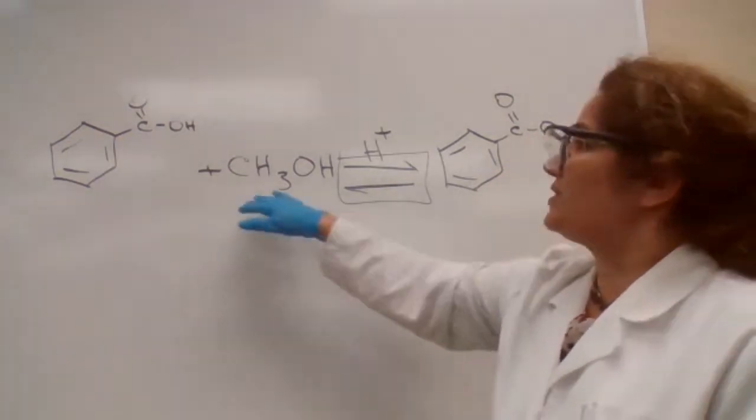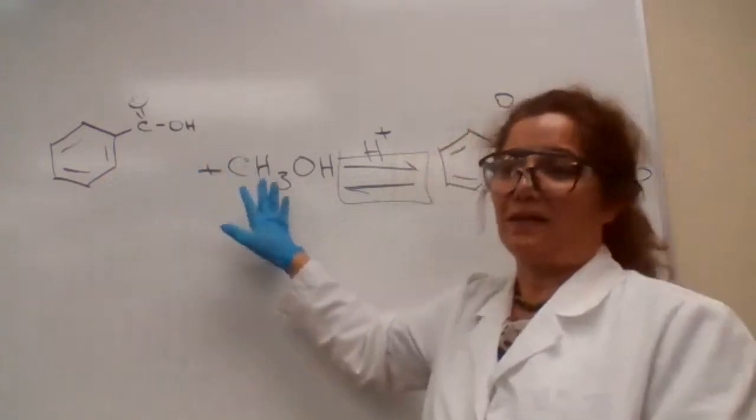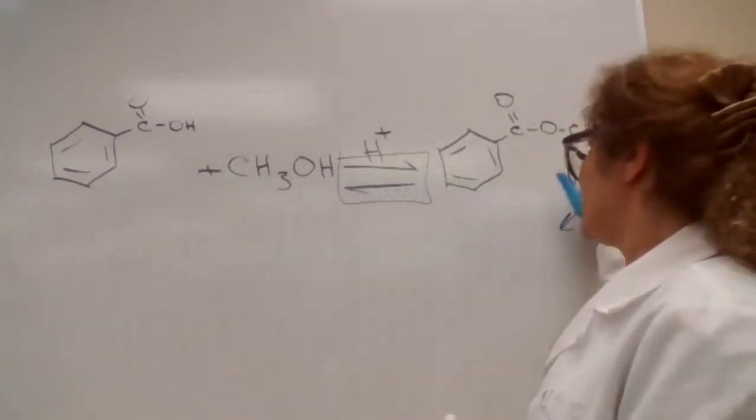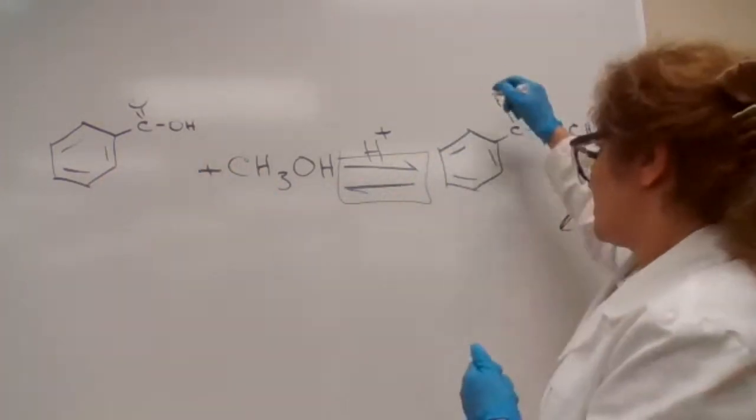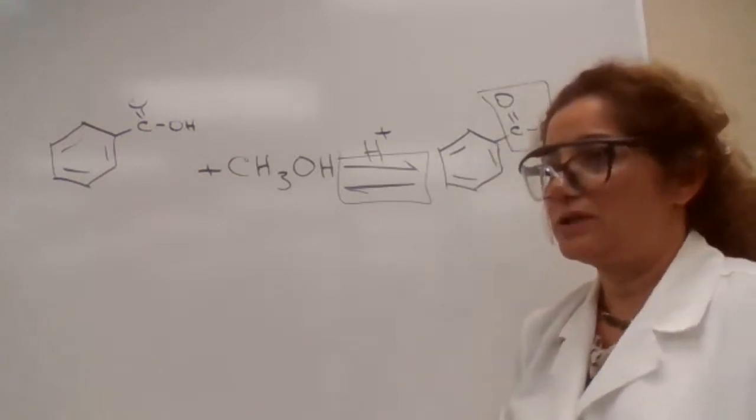So the reaction is called esterification. Your reactants are a carboxylic acid and an alcohol, and the product is an ester. In the ester functional group, you have the carboxyl group attached to two carbons, one on each side.